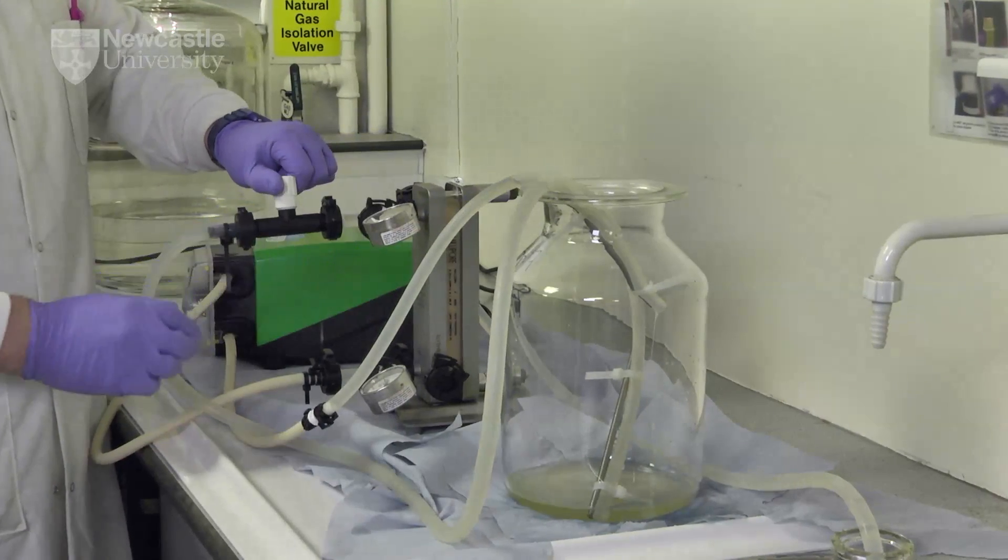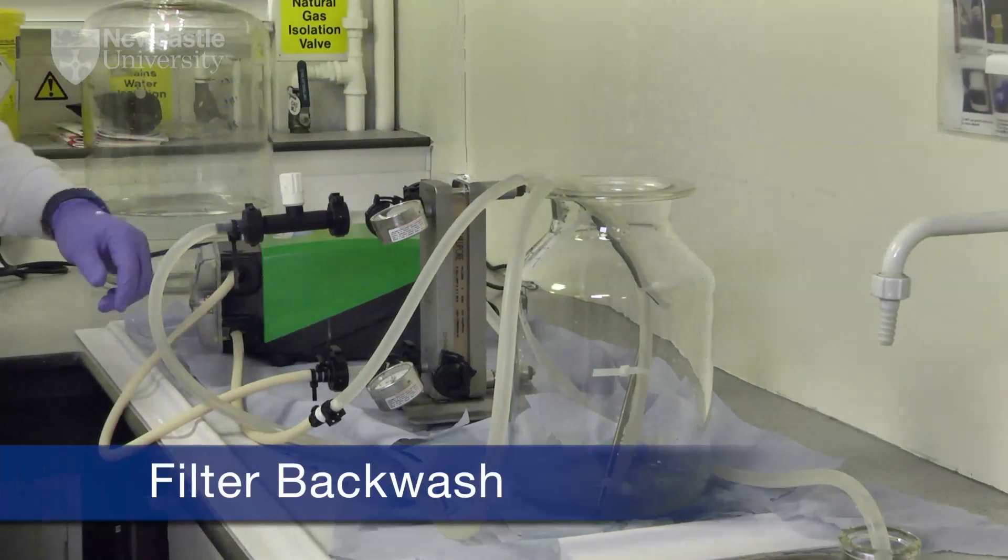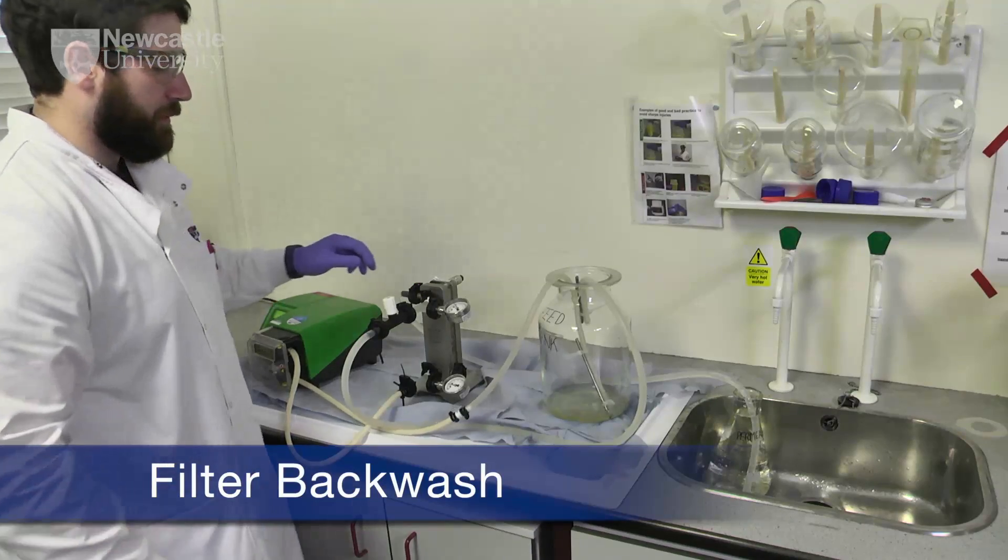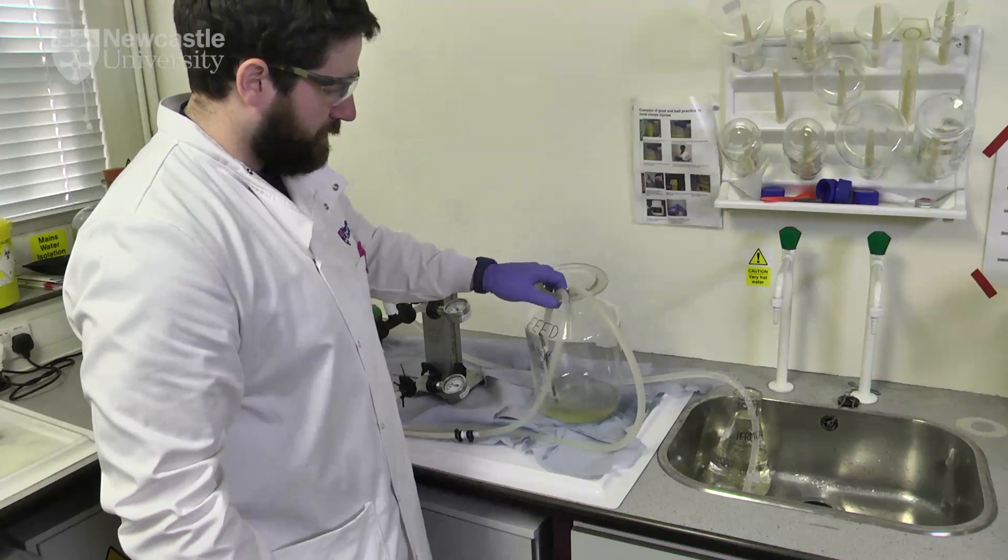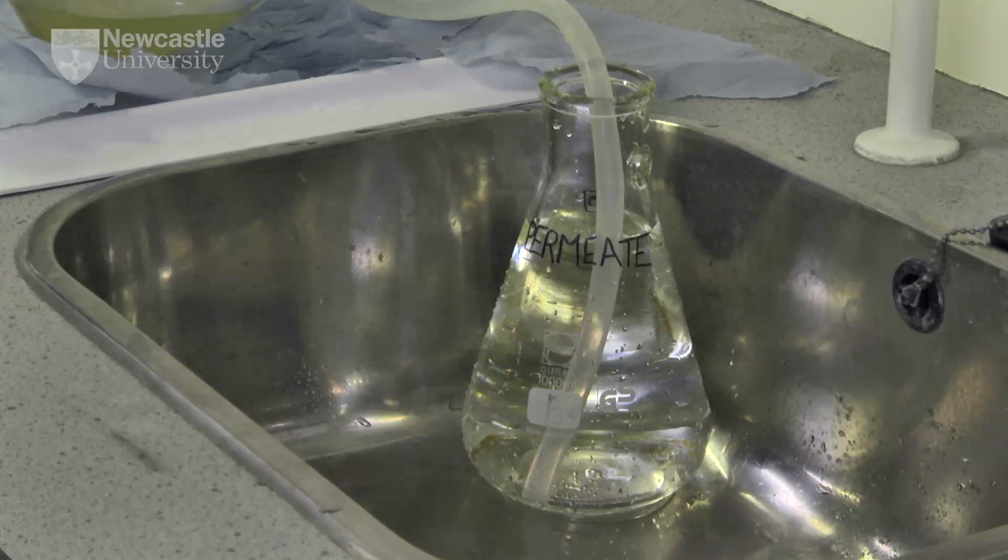The flow direction of the pump is then reversed, the retentate valve is closed and the pump is switched on, drawing approximately 500 millilitres of permeate back through the TFF manifold.